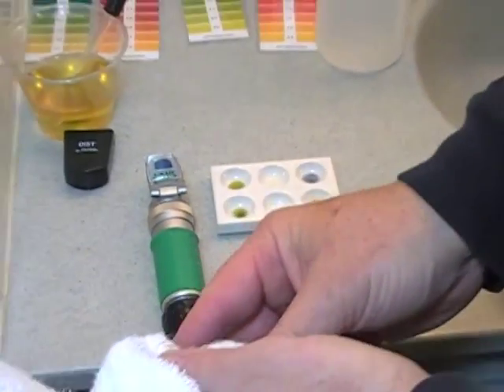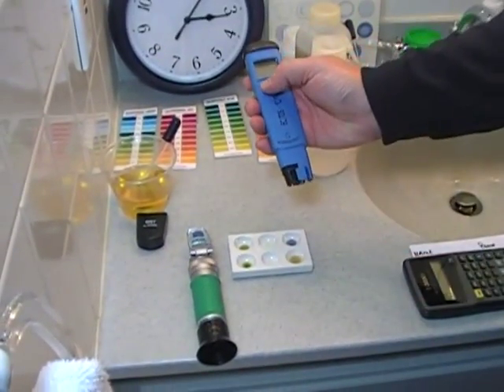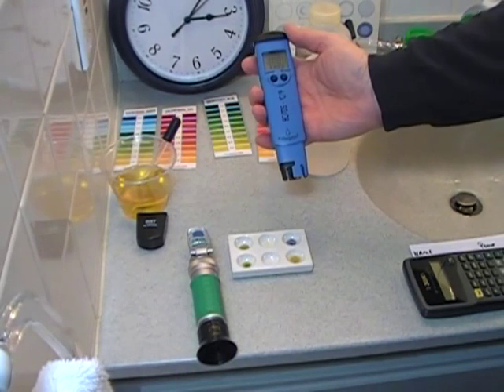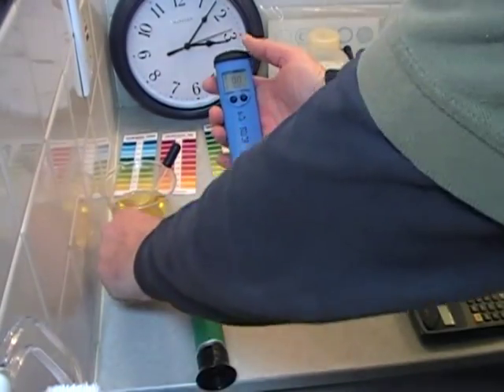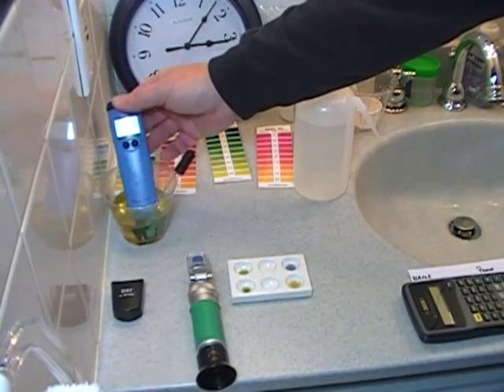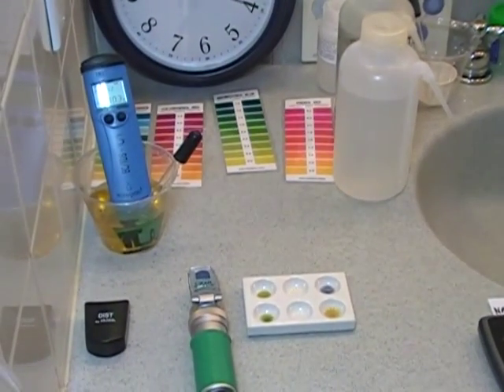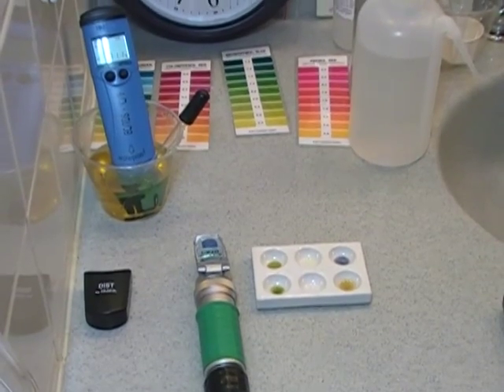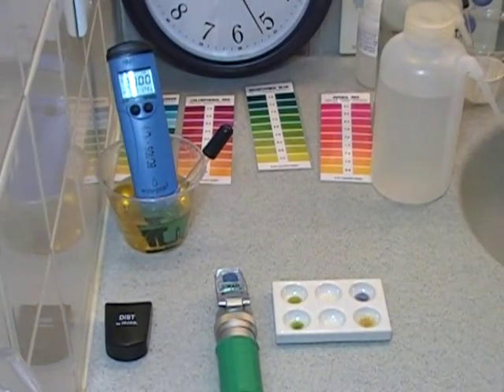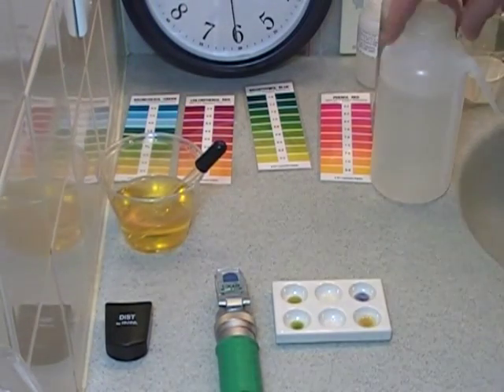We will now do the salt test. We will turn the meter on. We've already calibrated it — we will place it in the urine. The salt meter reads 20, meaning it's over 20,000 microsiemens. We must dilute and multiply — dilute in half and then multiply our answer by two.